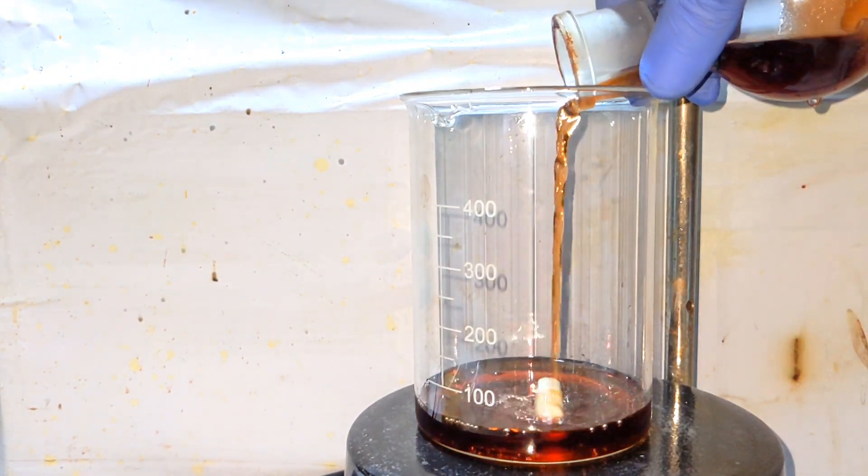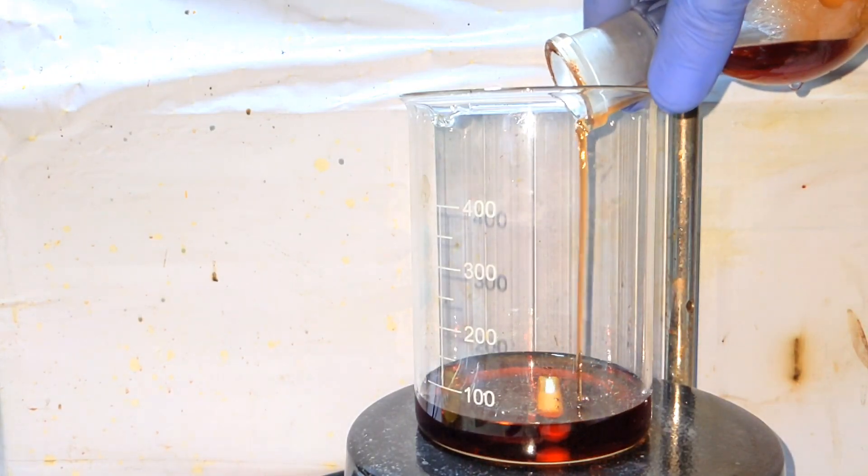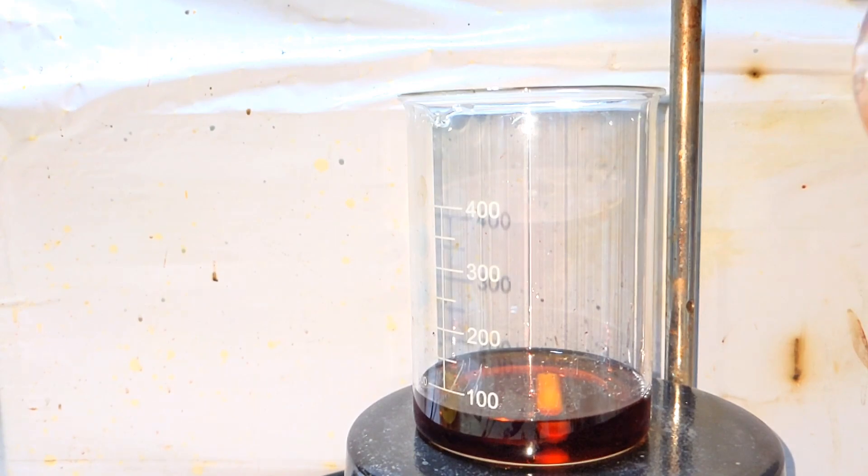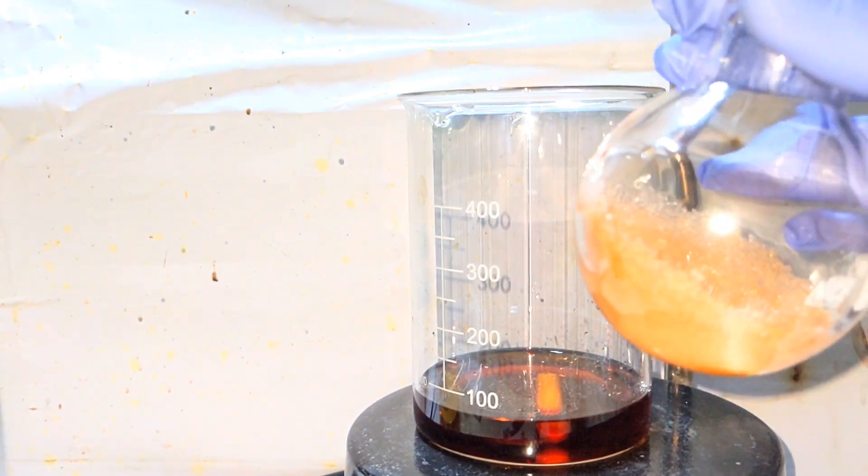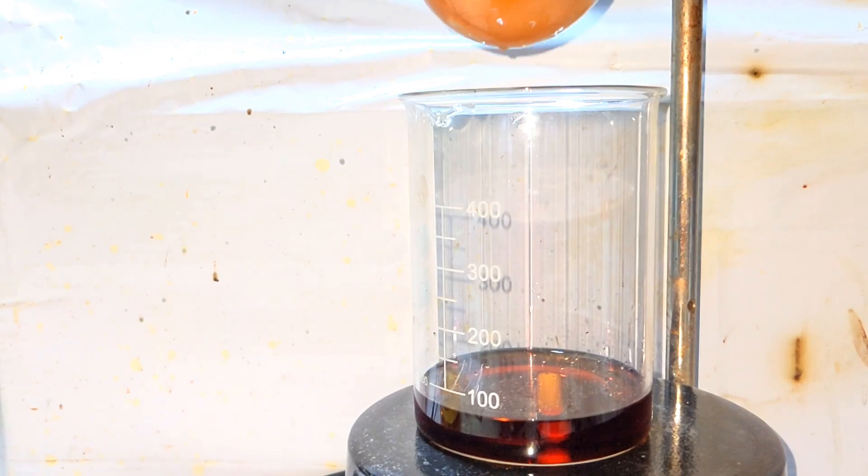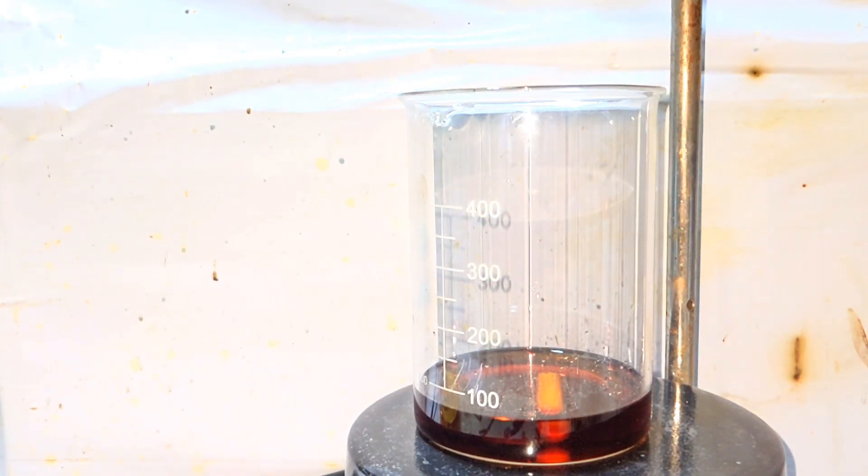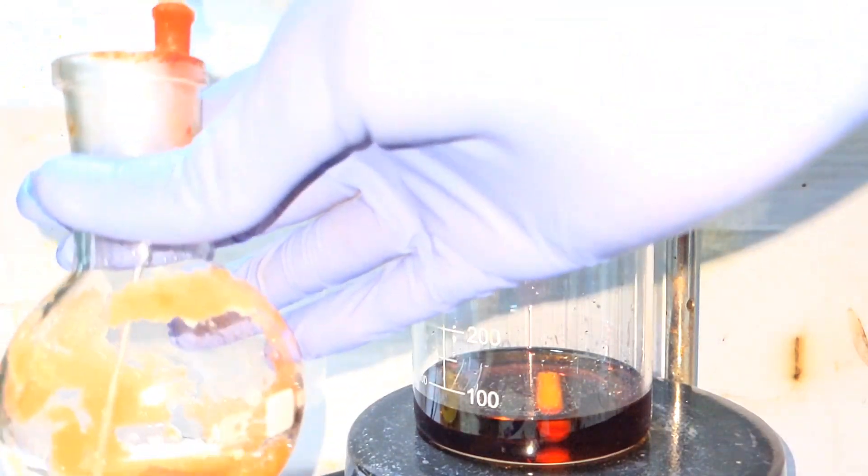After 15 minutes the flask was let to cool down to room temperature and the contents were transferred to a large 500 milliliter beaker. You can clearly see some crystals have already formed in the flask. Those crystals were washed down to the same beaker with some cold distilled water.